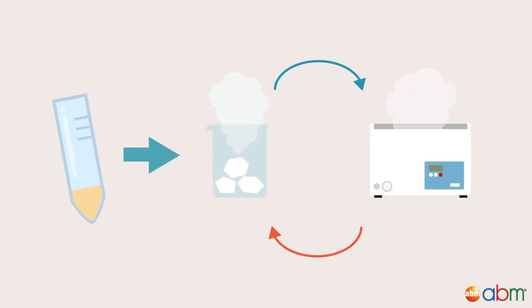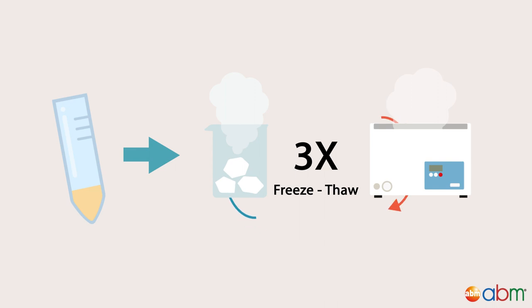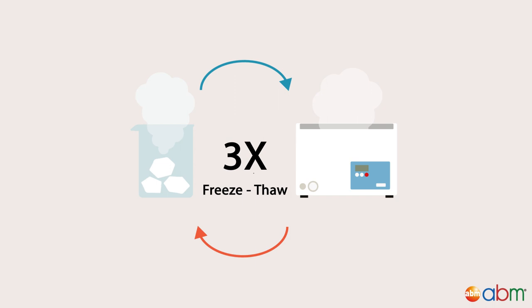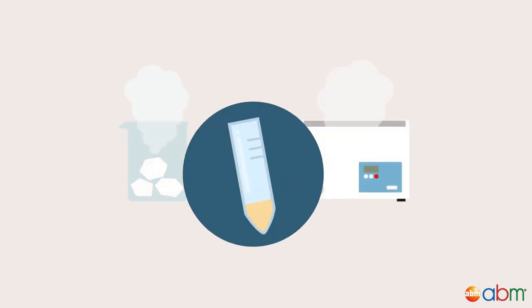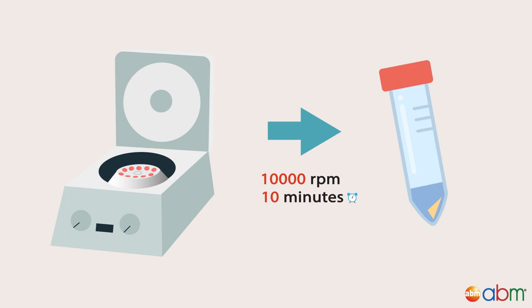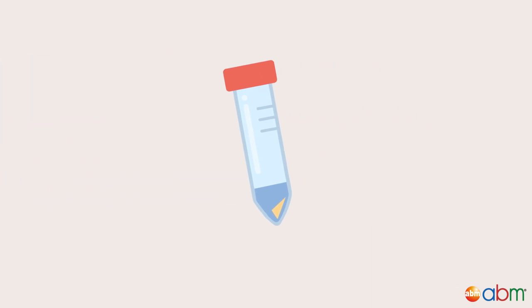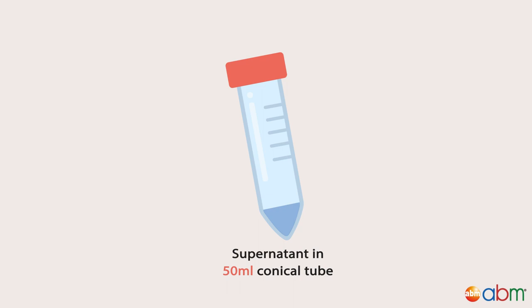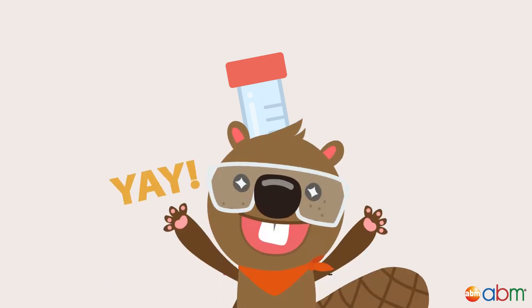Freeze-thaw the cell pellet 3 times by alternating between dry ice and a 37 degrees Celsius water bath. Vortex briefly after each freeze-thaw cycle. The freeze-thaw step will release the adenovirus from the cells into the supernatant. Centrifuge the lysate at 10,000 rpm for 10 minutes and transfer the supernatant into a new 50 ml conical tube. Your supernatant is now ready for virus purification.